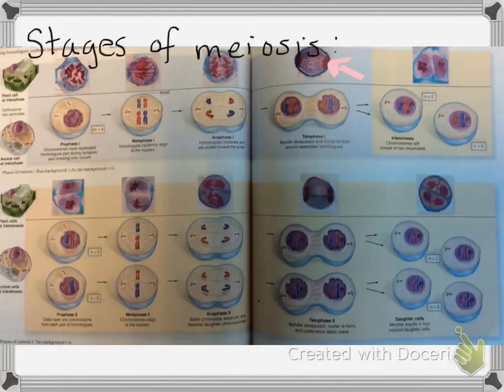Look carefully. It's definitely plant. Just because it's round doesn't mean it's not plant. How do you know that one's plant? Cell plate. It's making a cell plate. Does everybody see the cell plate? The artist's drawing is definitely animal, but the actual photo is plant. Y'all see the cell plates?